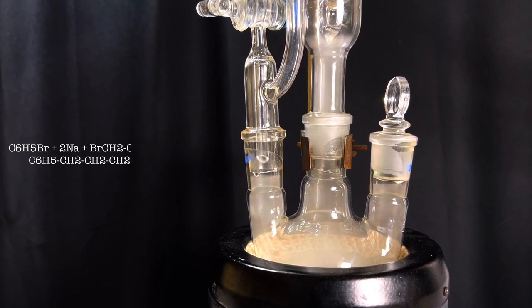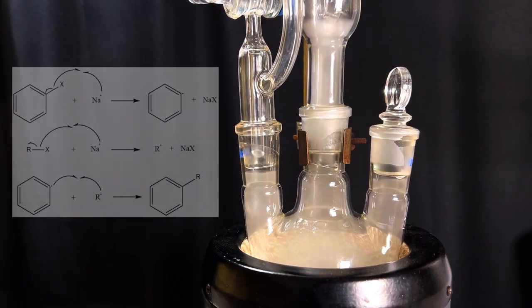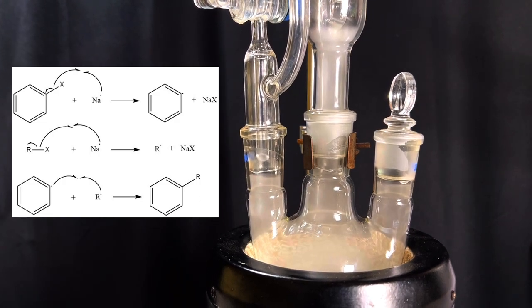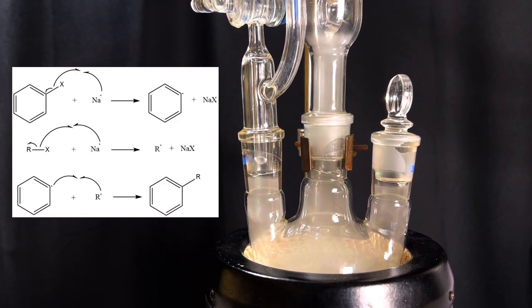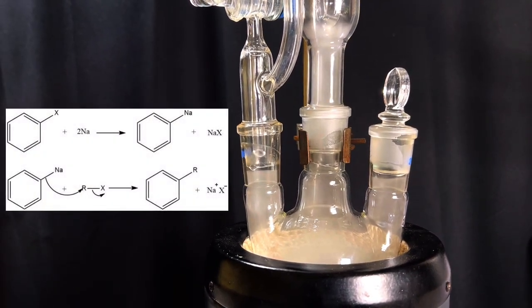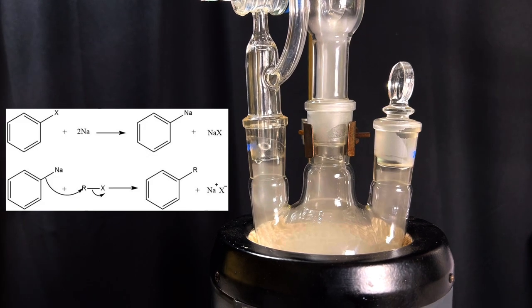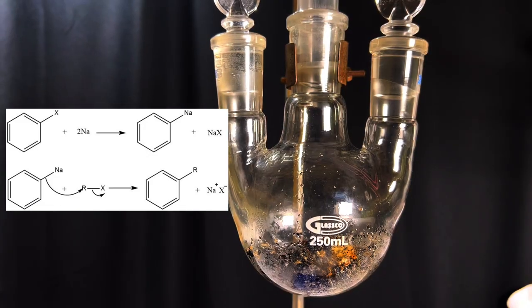Two mechanisms have been proposed for both Wurtz reaction and Wurtz-Fittig reaction. In the first approach there is sodium mediated formation of alkyl and aryl radicals which then combine to form the substituted hydrocarbon. In the second approach there is formation of an intermediate organosodium compound followed by nucleophilic attack of the alkyl halide.